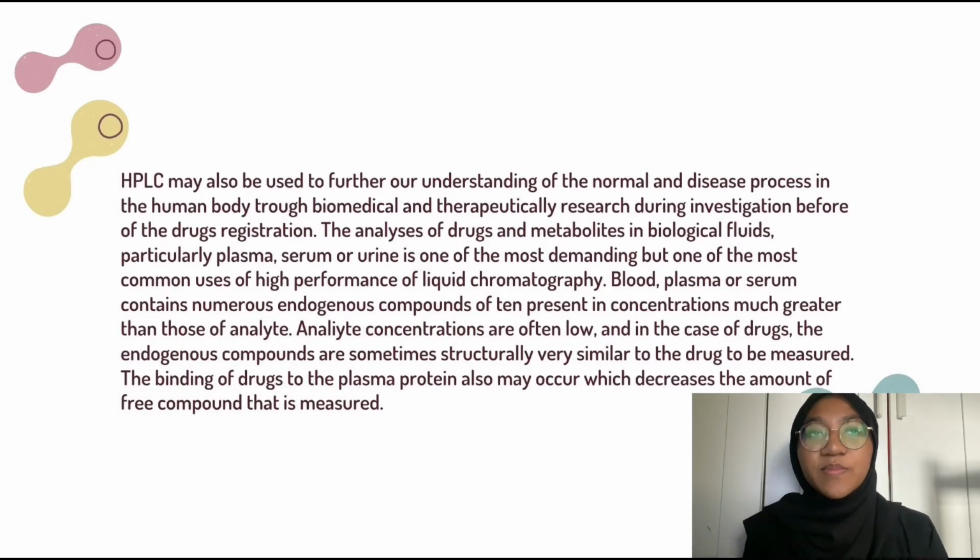Moreover, HPLC may also be used to further our understanding of the normal and disease process in the human body through biomedical and therapeutic research during investigation before the drug's registration. The analysis of drugs and metabolites in biological fluids, particularly plasma, serum, or urine, is one of the most demanding, but one of the most common uses of high-performance liquid chromatography.